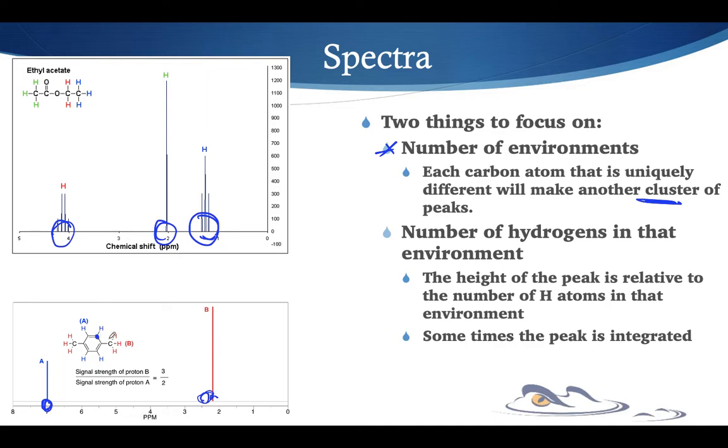So, like, let's look at that carbon right here. This carbon is part of our resonance, the arene resonance, and it's attached to what? It's attached to this carbon, it's attached to that carbon, and then there's a hydrogen on it, right? Look at this hydrogen right here in this carbon. What is that attached to? It's attached to this carbon, it's attached to that carbon, it's part of the resonance of that arene, and then it has a hydrogen. See, every one of these hydrogens here, the blue ones, if I were to describe those hydrogens, they would be bonded to exactly the same things.